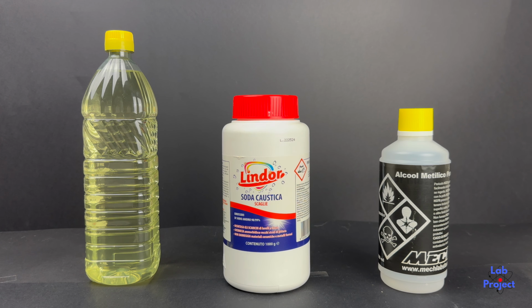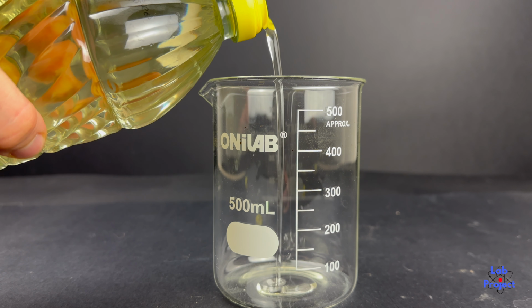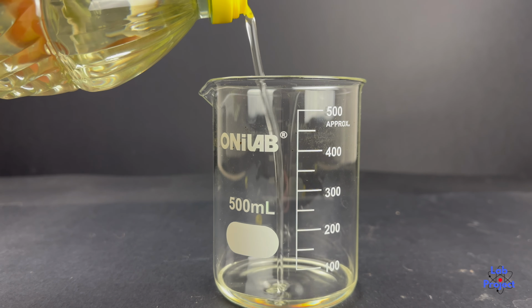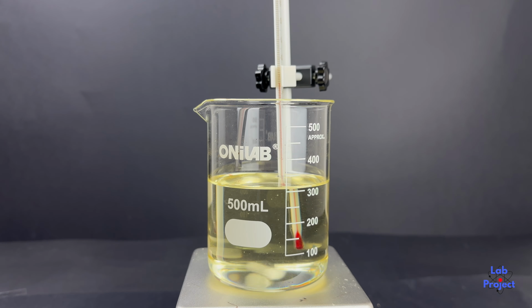Now let's start with the synthesis. This is what we'll need: vegetable oil, sodium hydroxide, and methanol. First, I poured 300 milliliters of oil into a 500 milliliter beaker. Then I took my heating plate and heated the oil up to about 60 degrees Celsius while stirring.